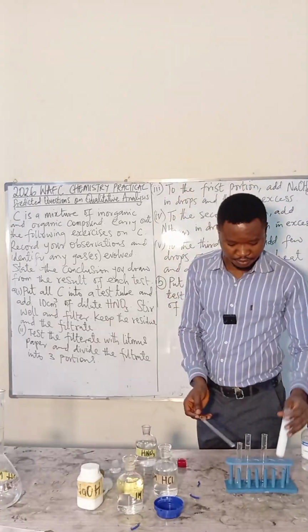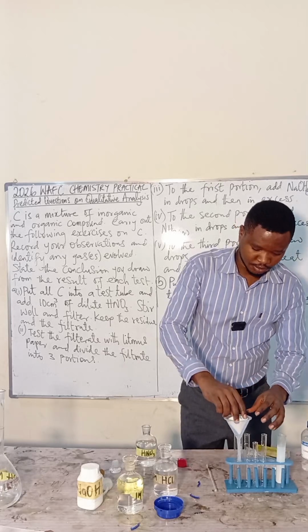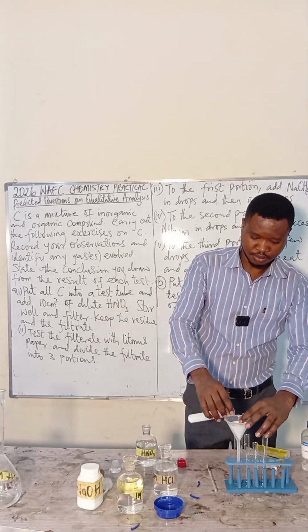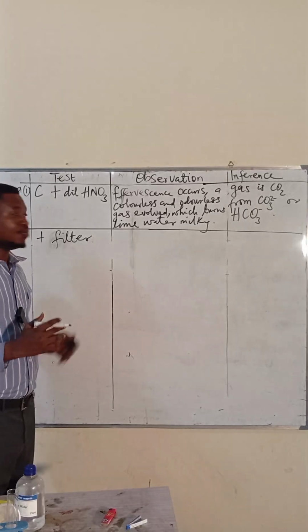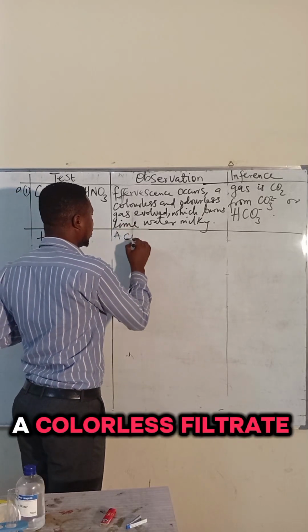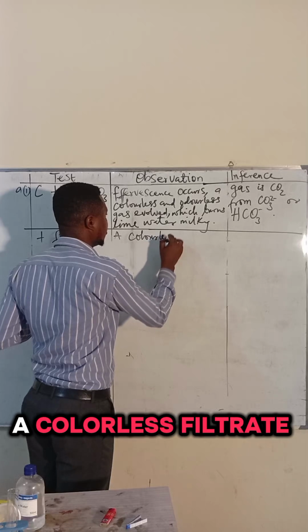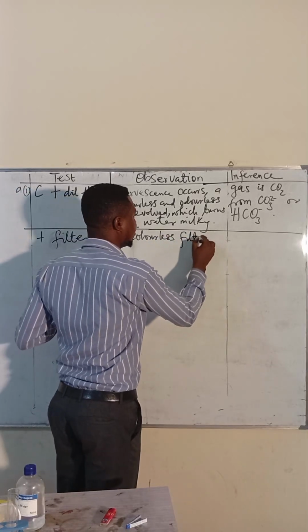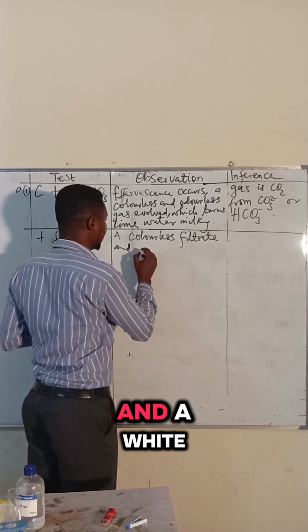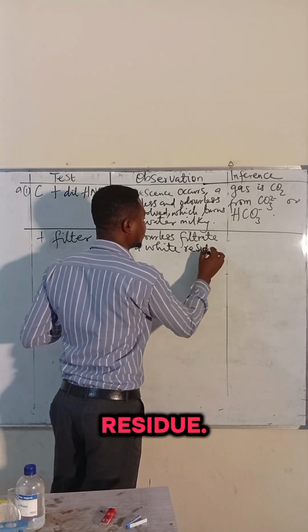We stir and filter. Now let's filter this. Plus filter, we have a colorless filtrate and a white residue.